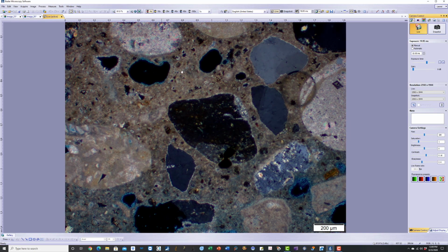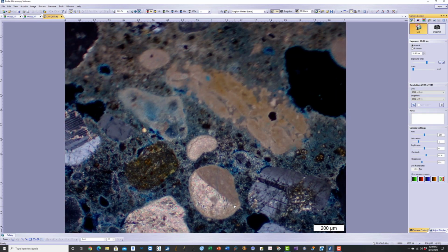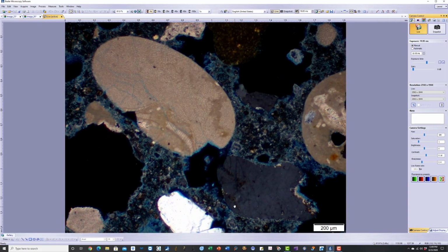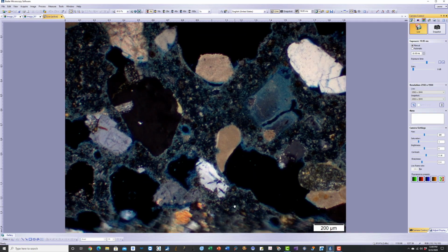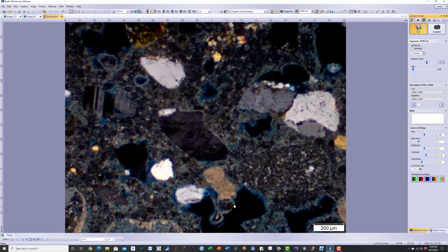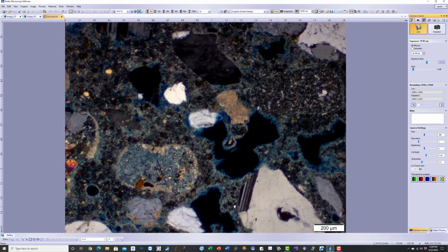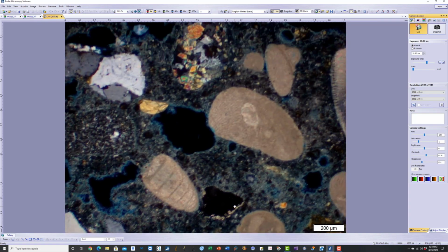You can see it's more carbonated and relatively less carbonated, and as you go down more, you see carbonation of paste, but it's the porous area, then relatively less carbonated portion coming in the interior of this mortar coating. This is a thick, about 20 millimeter thickness mortar coating, where you have a mixture of silica sand and seashells.